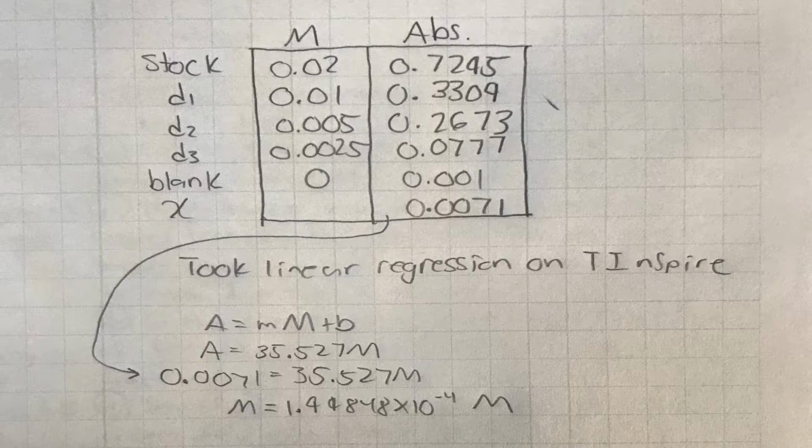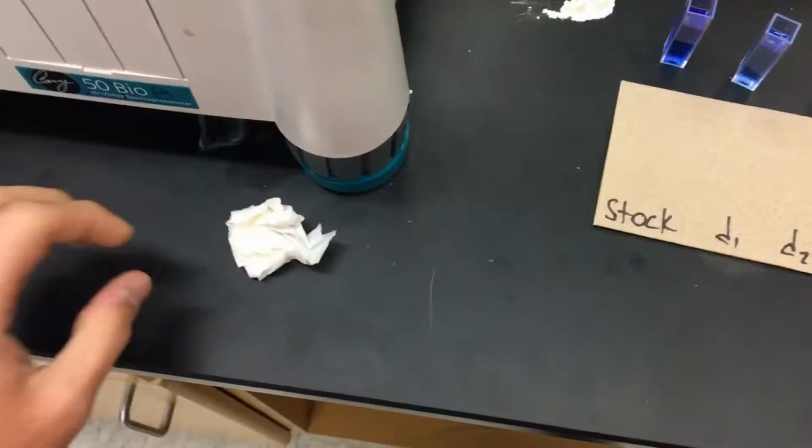Once we measured and recorded all the dilutions, we calculated the molarity of the unknown, and then we cleaned everything up.